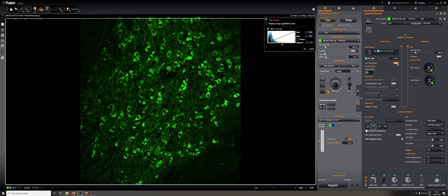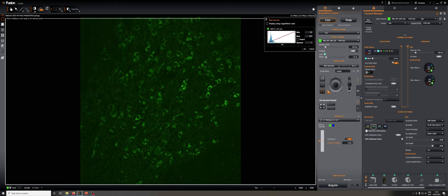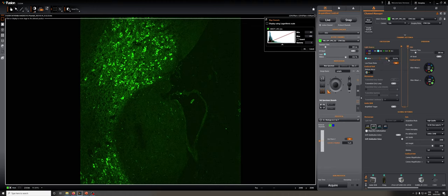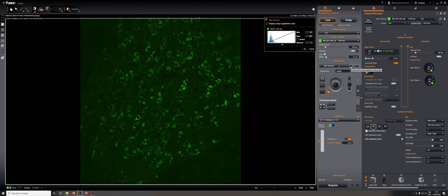When you do that, you can go down below 2%. If you look at this with low power mode on, my maximum laser power is now 10%, whereas without low power mode it's 100%. But when I'm in low power mode, I can go from 10% down to 0.2%. So if you wanted to use a very low laser power, you could by using this low power mode.